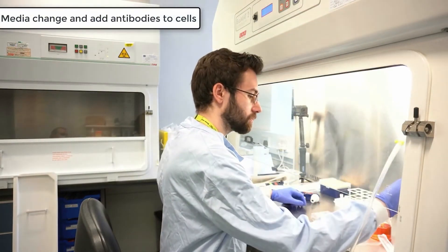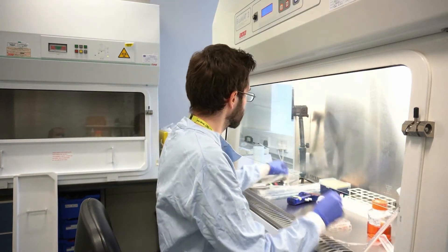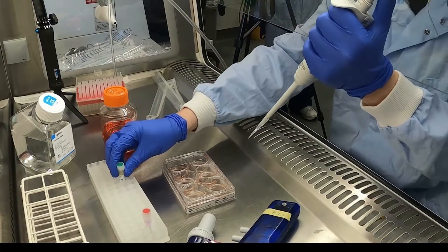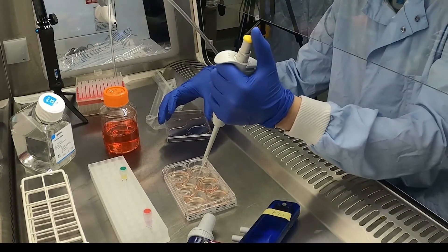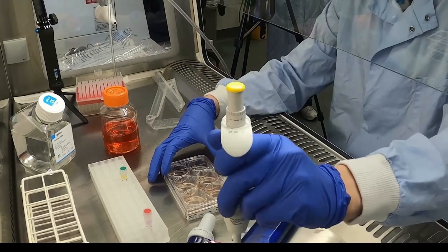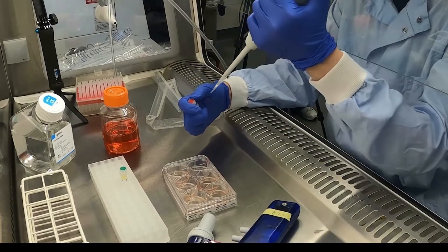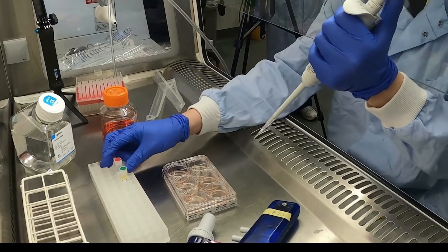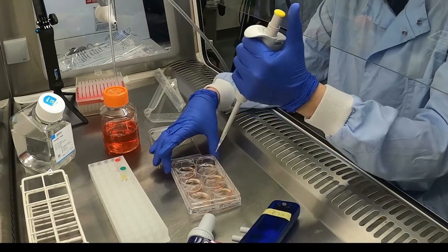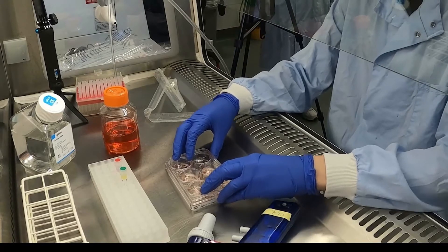Next, aspirate the spent media and replace with fresh media. Then add 20 microlitres of each antibody — TRA-1-60 and CD44 — directly into each well.